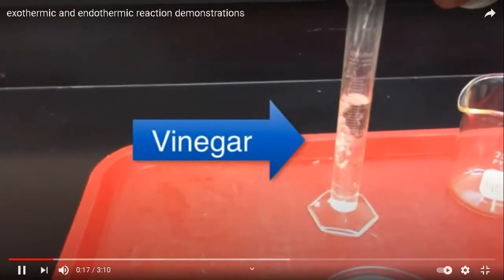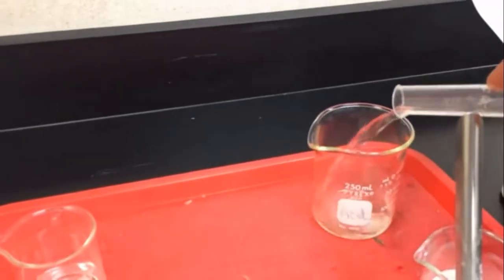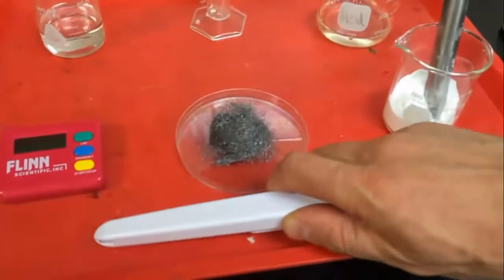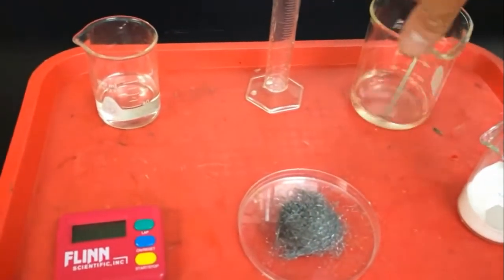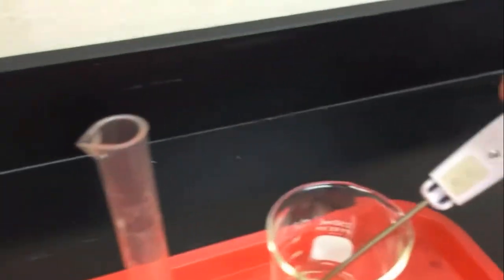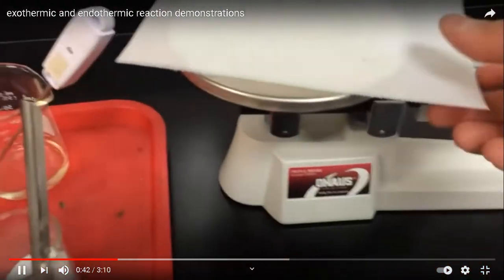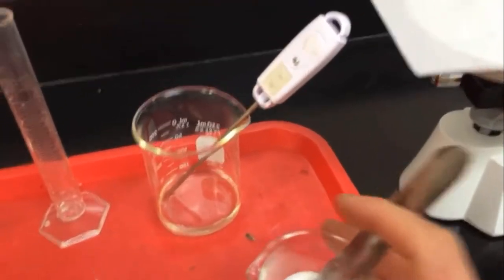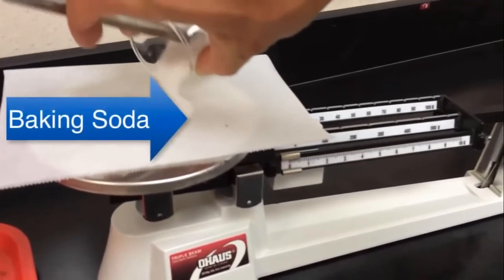They used vinegar. They measured the temperature by using a thermometer. Before the reaction, the temperature was 22.4. Then they took the mass by using a balance of baking soda.